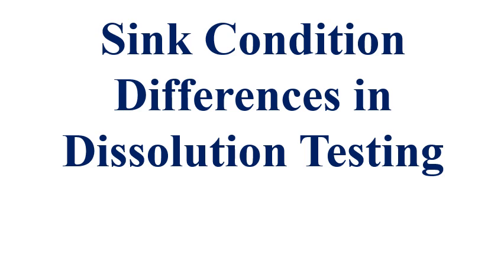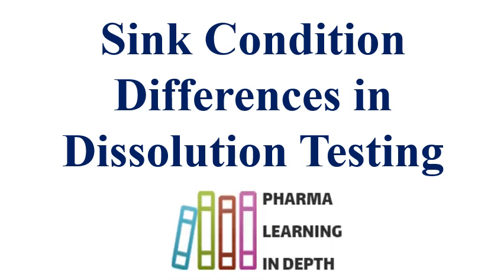Welcome, dear viewers, to the video on dissolution testing. In this video, we are going to learn regarding the sink condition differences.